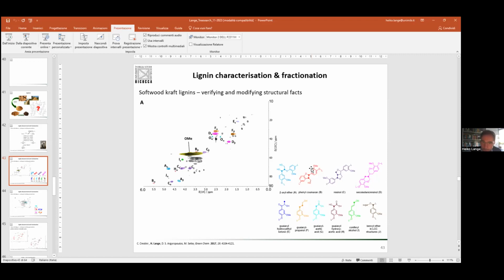Yeah, well, unfortunately, if you cannot fractionate, and if you cannot concentrate the sample, it's the only way. The other way, obviously, is running more scans on the same concentration of sample that you used so far, or you try to concentrate the sample. Okay, yeah, makes sense. Right, and concentrating the sample is not trivial, however, because you easily run into solubility issues.